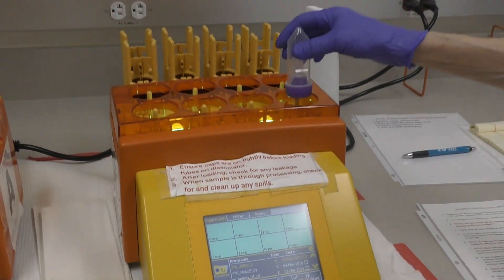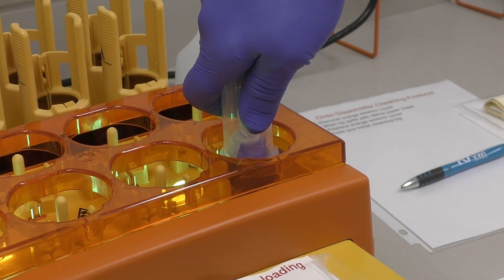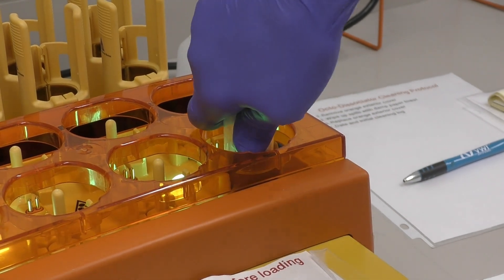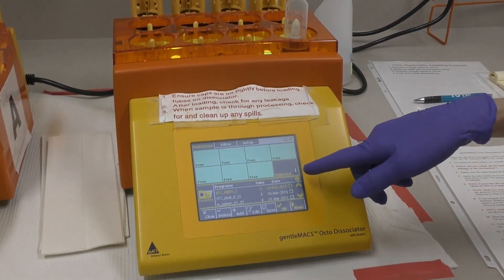Next, place your tube in any slot. Push straight down until it clicks. It will show on the screen as selected.